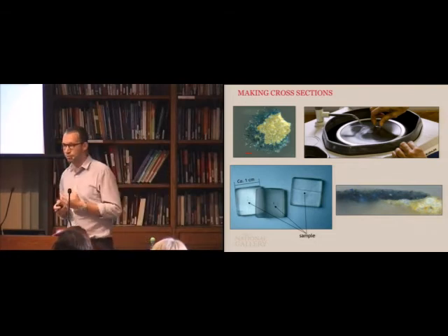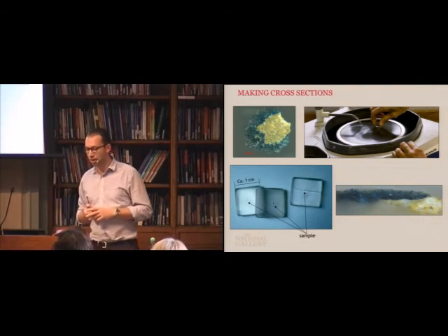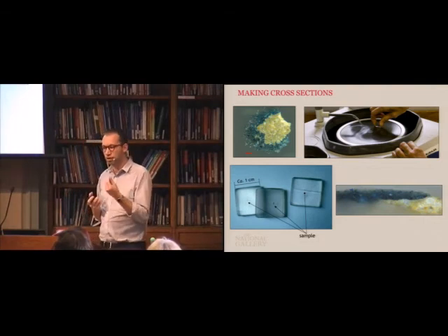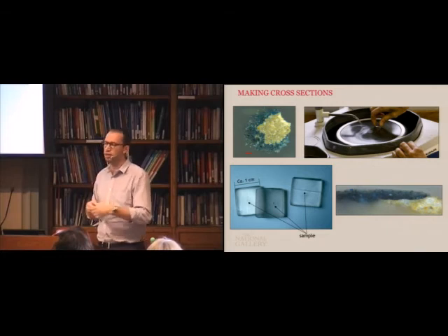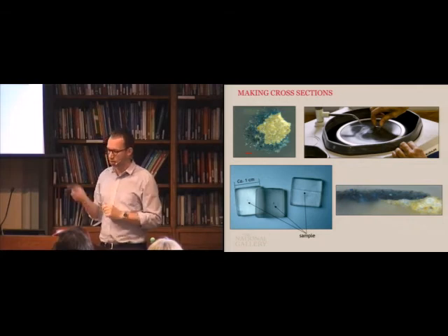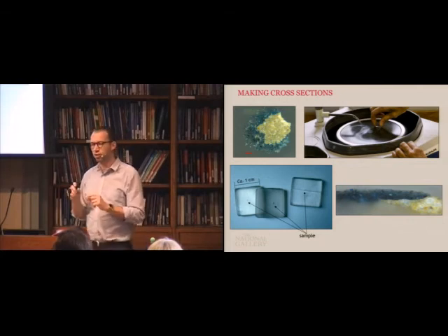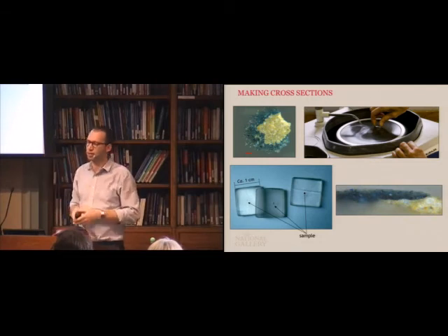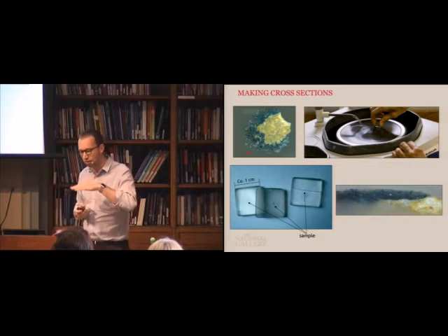There's another type of sample that we take, which is what you call a cross-section sample. The GCMS sample, I scrape it, I get a powder, and I manipulate that powder, and I put it in my instrument, and it disappears. That's it, it's gone. Cross-section's a little bit different. I'm not so much interested in one layer. I'm interested in all the layers of that painting. And I'm interested in the layering of the paint.